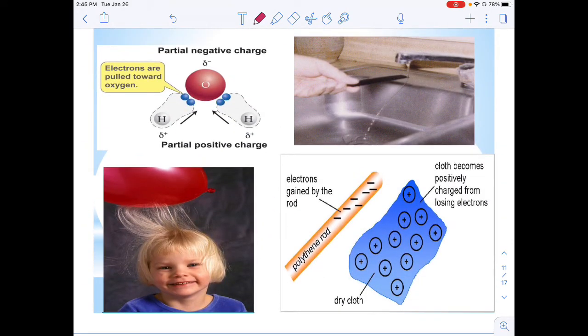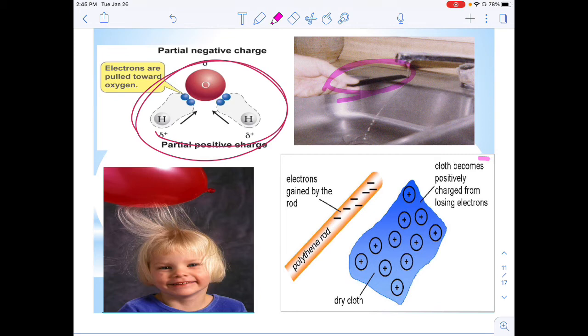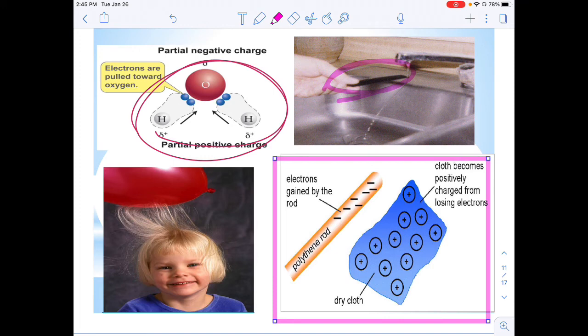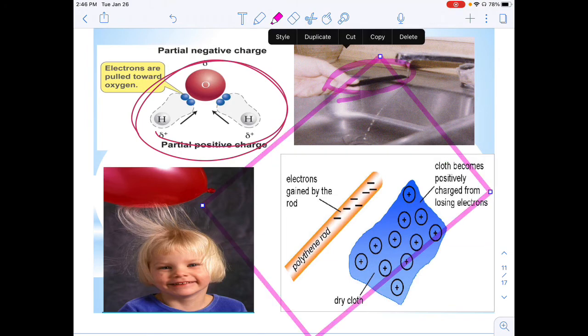Station 5. Again, we have water is charged. When we took the rod, ours looked like this black plastic rod here, we charged that up and put it near the water stream, and we get this. It charges it up, and then it's able to pull that water towards it. Again, it's like opposite magnets: you get a positive, negative charge, they're attracted to each other. There you go. Cyclohexane is not polar, it has no charge to it, so it just is a stream that goes straight down.